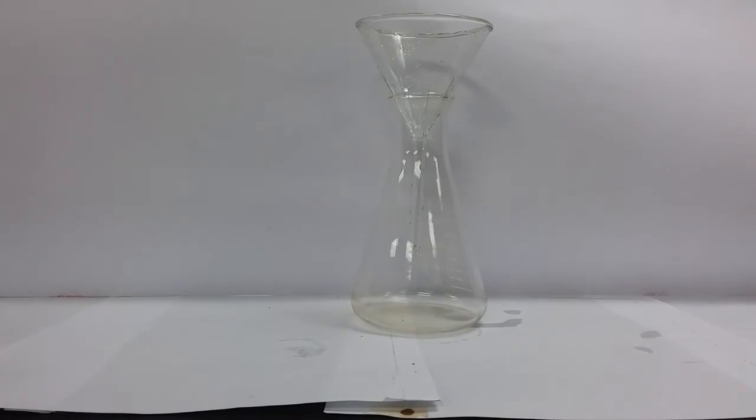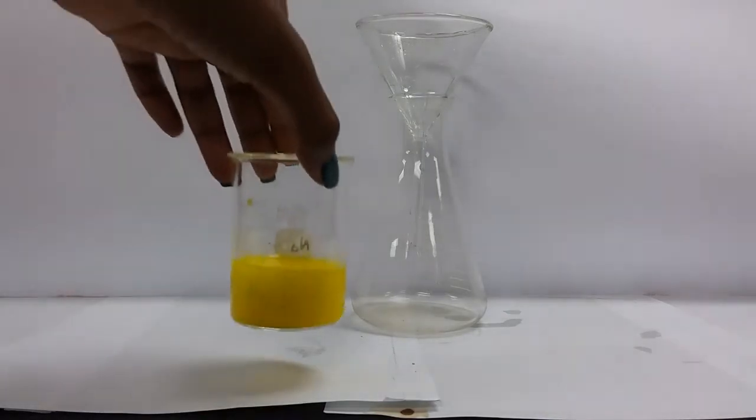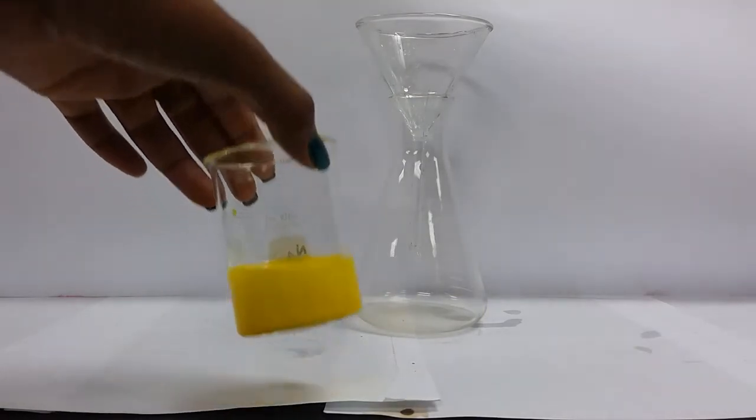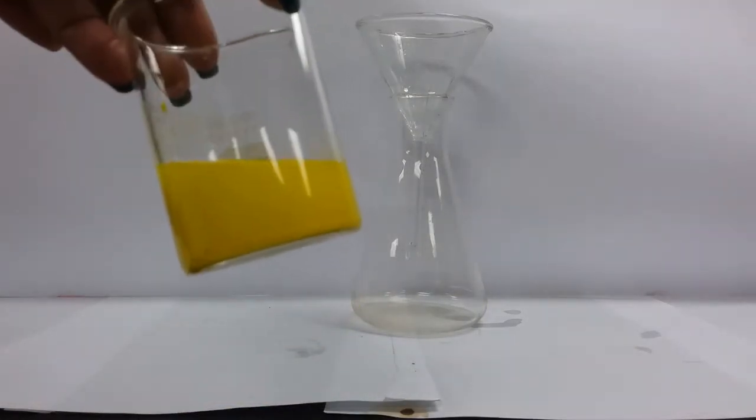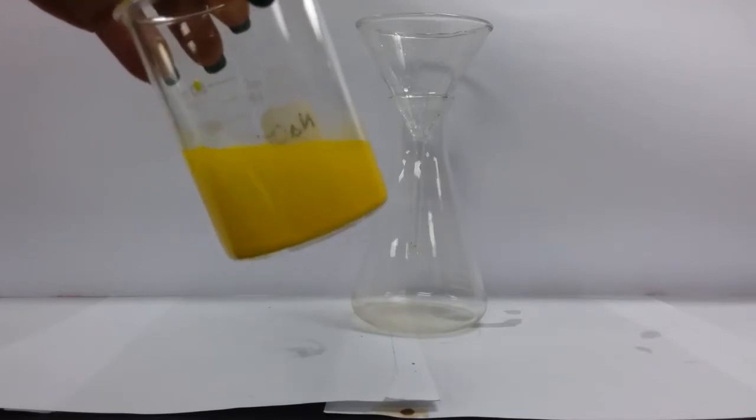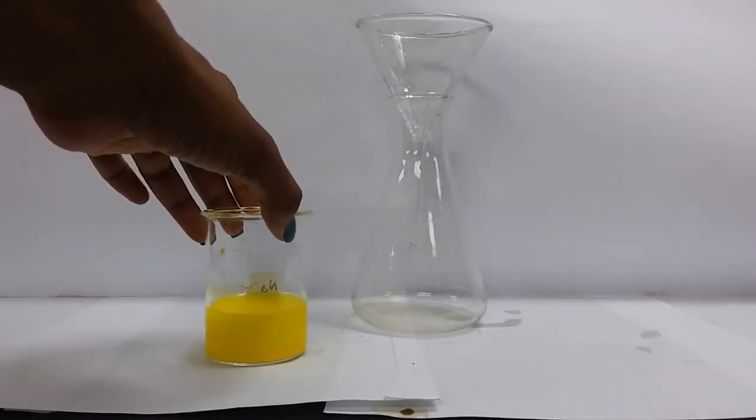So the next thing we do is filter our mixture to separate our solid precipitate from the filtrate, which it is currently mixed in with. And if you can see, or maybe not in the camera, this has already started to settle out.